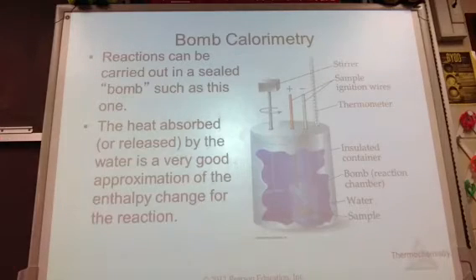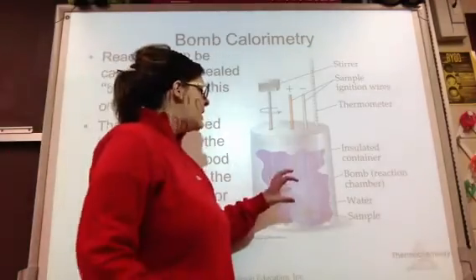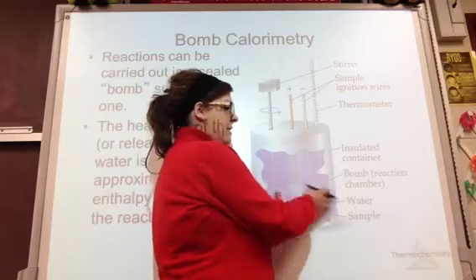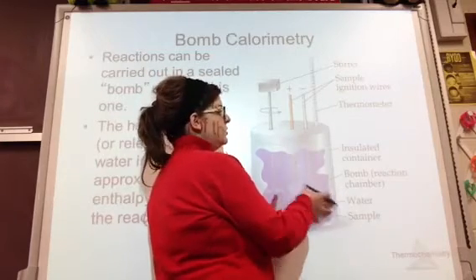When that wire becomes hot enough, that's when we get the combustion reaction to happen. All of that heat released when the combustion occurs will be absorbed by the water, because a combustion reaction, we know, will definitely release heat. So I'm going to get a bunch of heat generated or given off from that system to the water, to the surroundings.